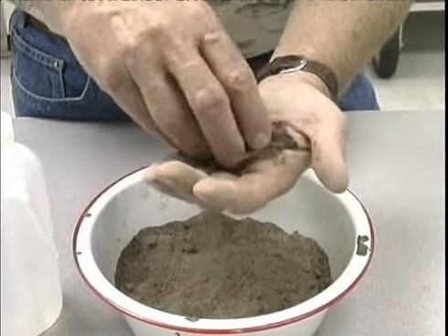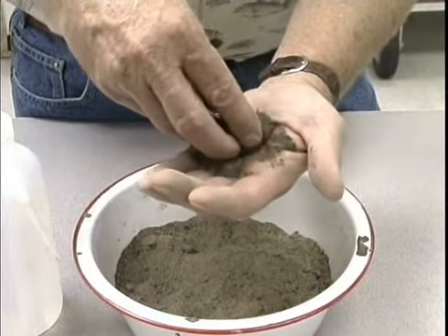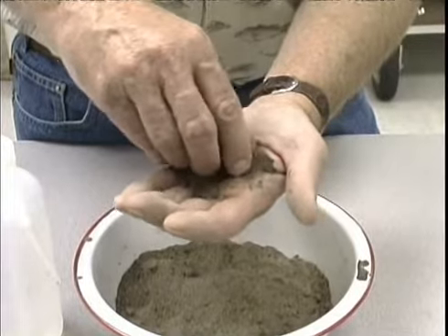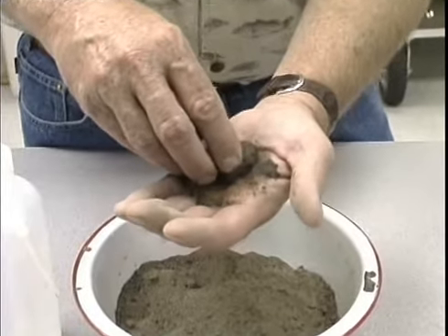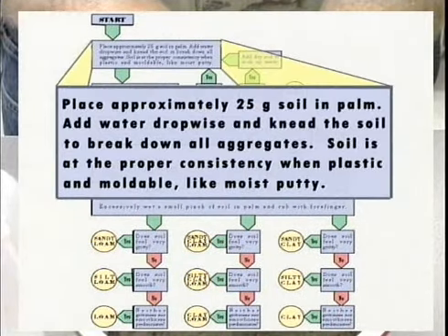It will take a little bit of practice at the beginning. If you get it a little bit too wet, add soil. If you get it a little bit too dry, just continue to add moisture. So on this first soil sample, we've examined it dry and it looks to be a very coarse textured soil. Now I'm going to start following this procedure outlined on your lab handout on page 4. We start at the top: place the 25 grams of soil in the palm, add the water, knead the soil, break down the aggregates, getting it to the proper consistency when it's plastic and moldable.